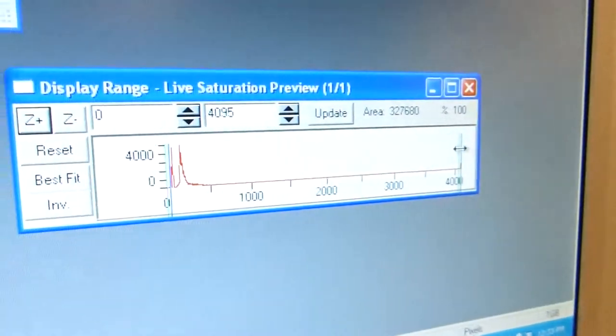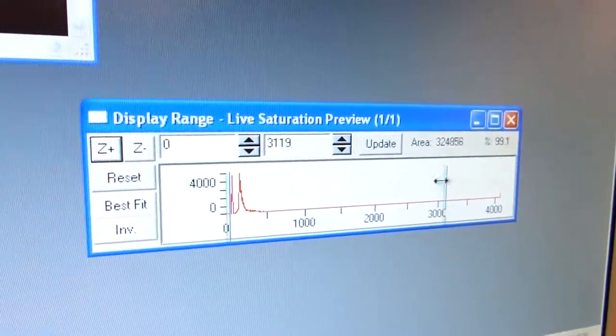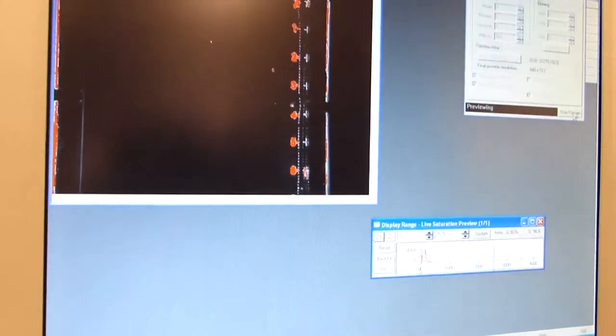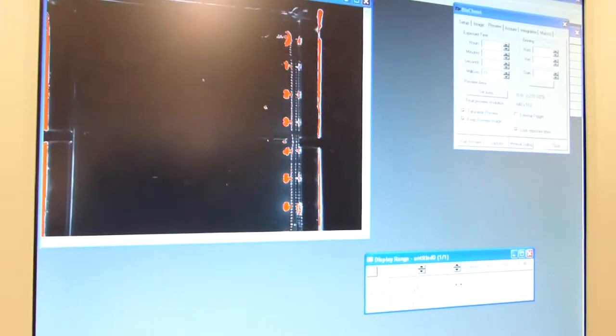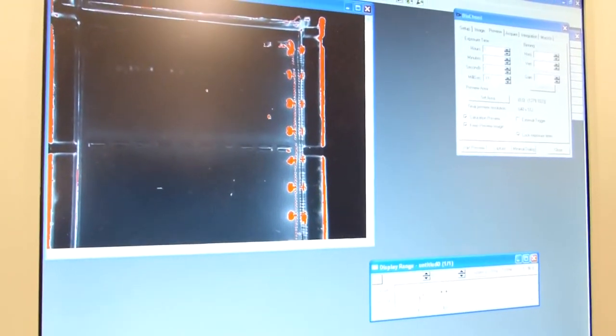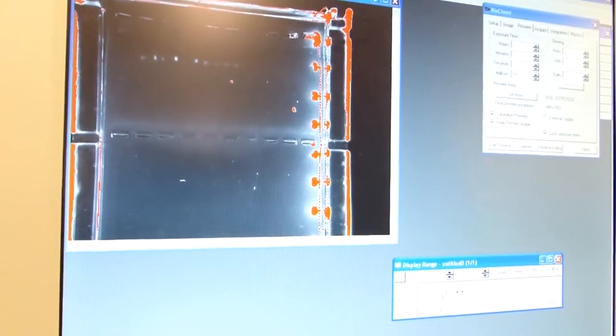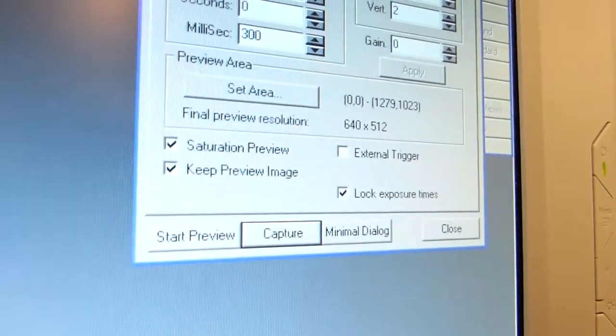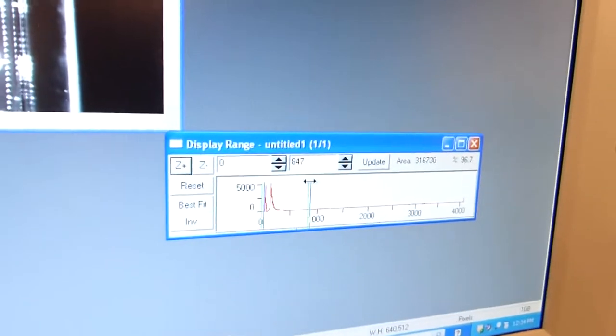From here you can start a preview and then go to edit display range. From here you can slide this green bar, green and blue bar on the left. Hit stop preview and then slide this bar until you are happy with your image or find the setting where you can best see the DNA. From here you can hit capture.